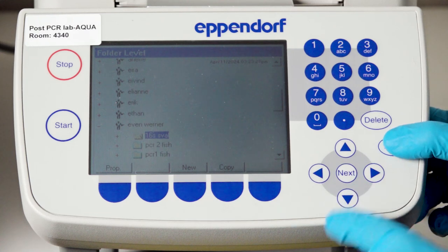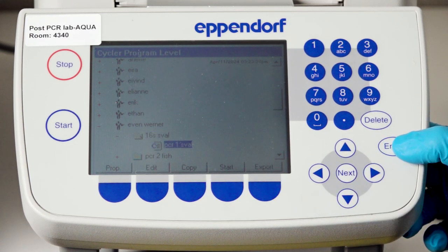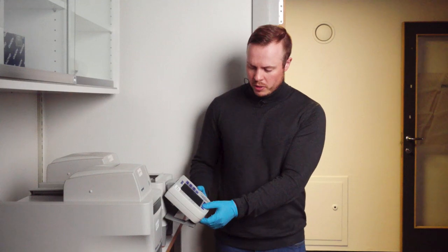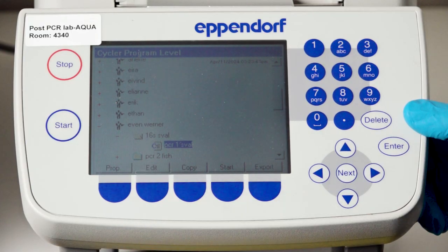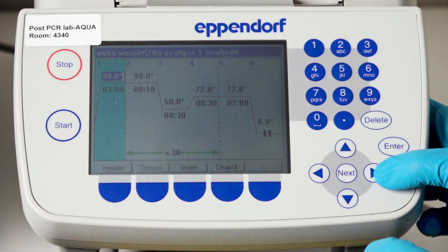I push one down, push enter again, and here we have the program. Sometimes you edit the program, change the amount of cycles, the temperatures and so on. So it's always very smart before you run it to push the button that says edit, and then you get up the program.